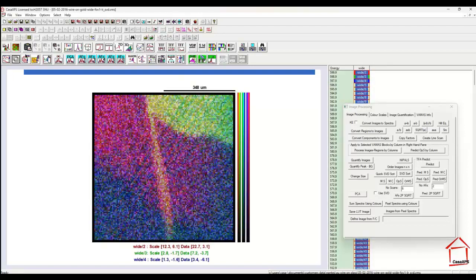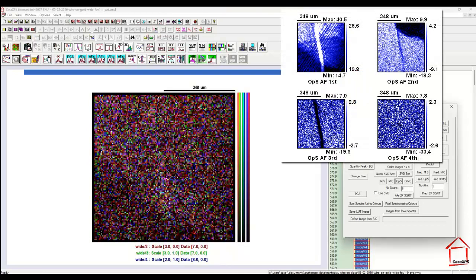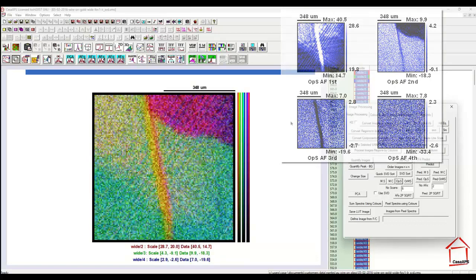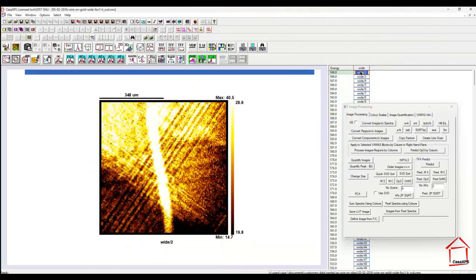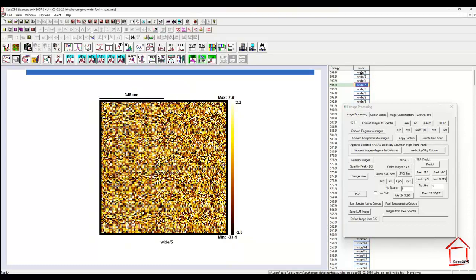and when I perform an optimum scaling, again calculating 6 abstract factors, I end up with 3 abstract factors that look like there's information within them, and the 4th one is noise. When we're trying to analyze data with noise, it's probably worth working with something that we're more familiar with to understand what is happening and why optimum scaling might be different from a direct PCA application.